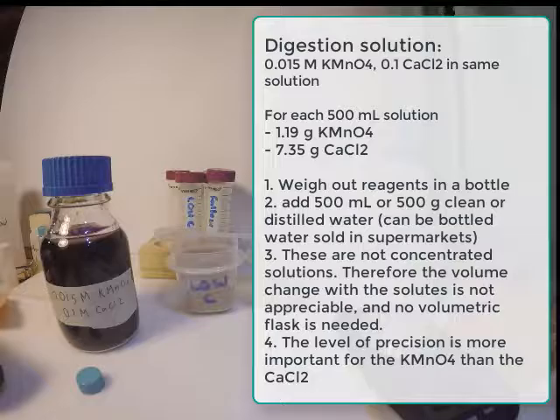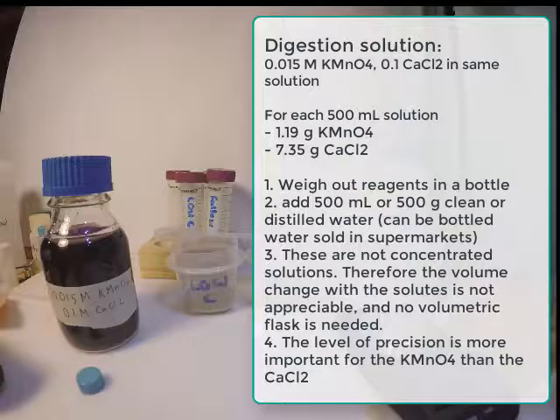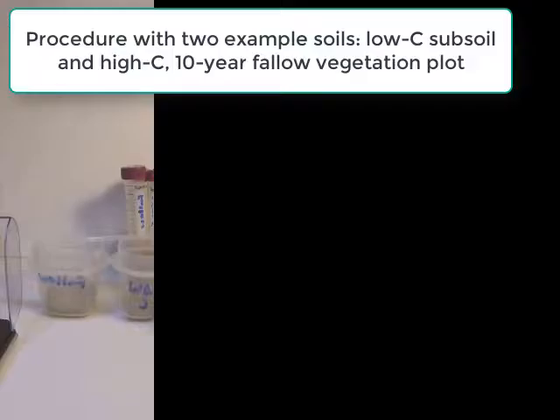Here is how you make the reagents. For each 500 milliliters of solution, you will need 1.19 grams of potassium permanganate and 7.35 grams of calcium chloride. You can weigh these out in a bottle and then add 500 milliliters of clean or distilled water. Because these are not concentrated solutions, you will not need a volumetric flask — you can just add the reagents to 500 milliliters of water.